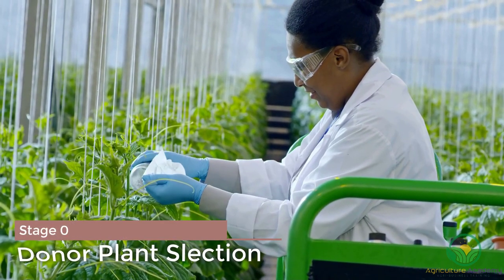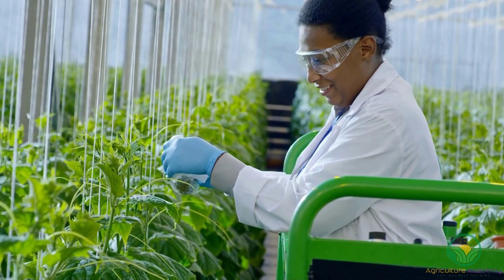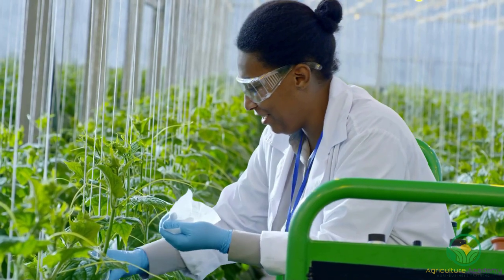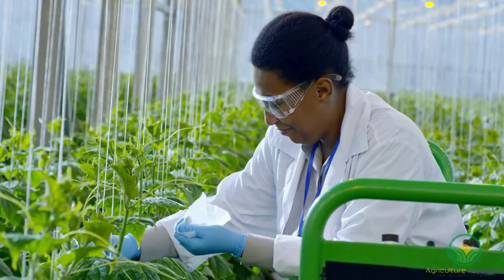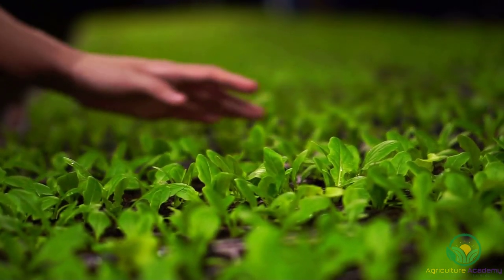In stage 0, an ideal plant donor must be selected. The correct genotype must be selected to ensure the plantlets will be true to type. Pathogens also need to be controlled. This can be achieved by growing the donor plants in greenhouses in an inorganic growing medium and by washing the explants thoroughly with a bleach solution. Selected plants should be healthy and show no visual symptoms of pathogen or insect infestation.